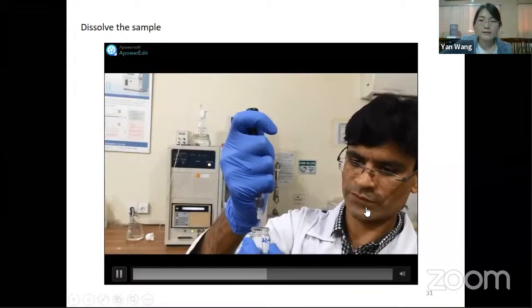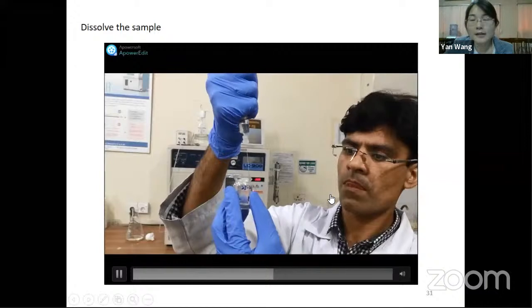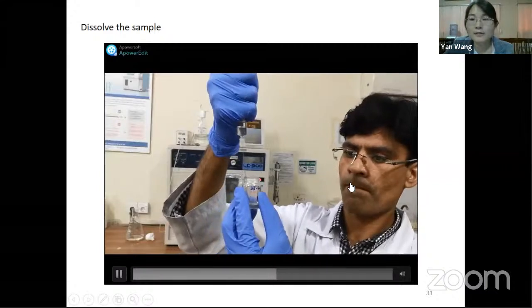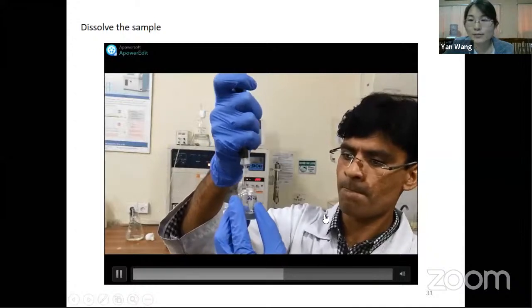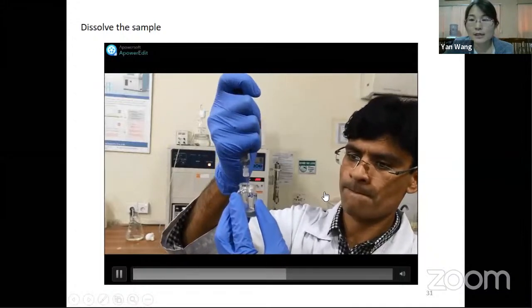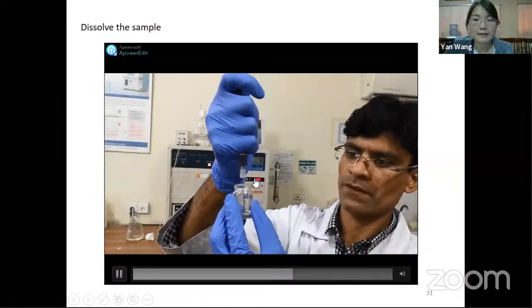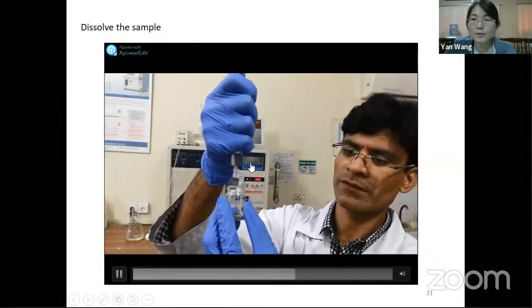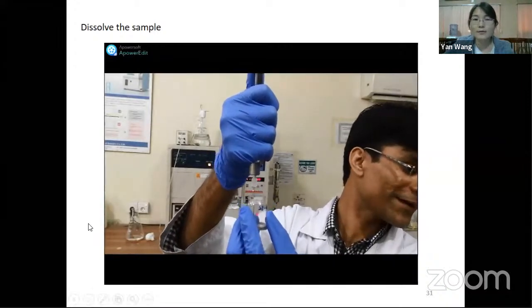So here, this is my PhD student, Mr. Amir. If you have any questions, he's also online because he also joined me to prepare the presentation, so he will answer related questions, okay? And he's taking the proper volume of the mobile phase to dissolve the sample.